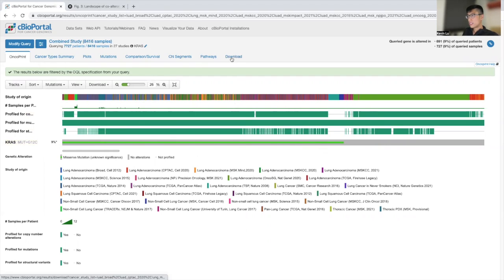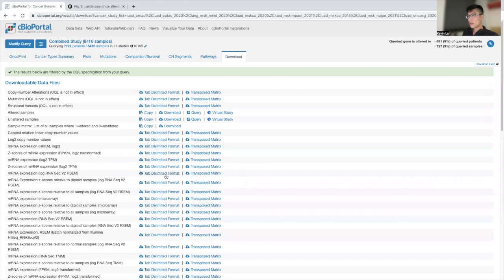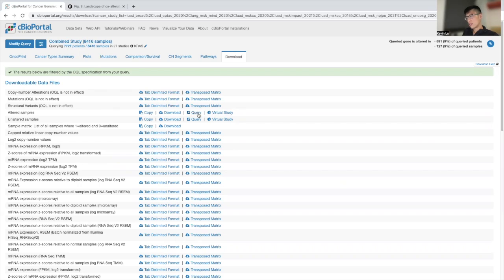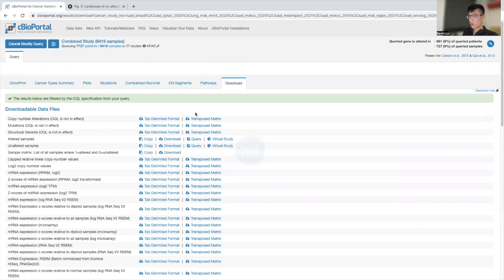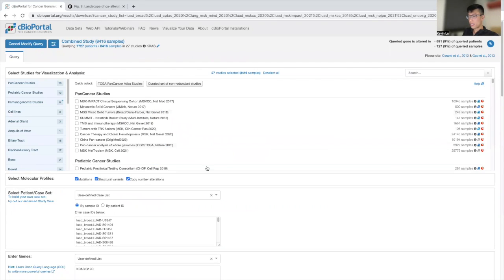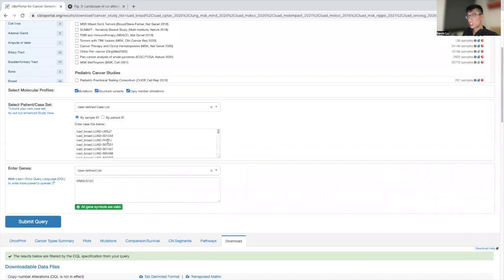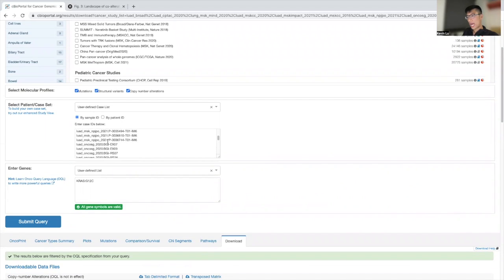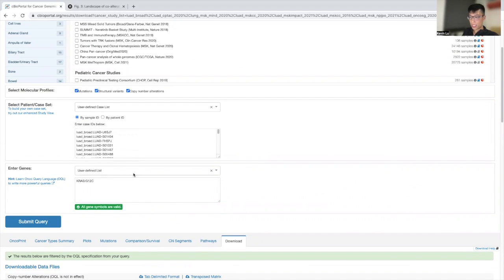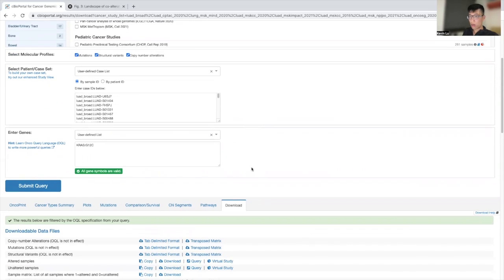So we're going to hit download. And we're going to hit virtual study or query study. But I think for this tutorial, we're going to hit query study. So now we have all the patients who have the KRAS-G12C mutation altered samples.